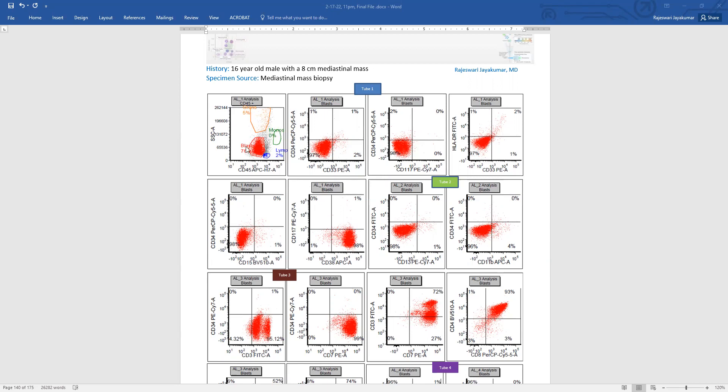So now let's follow through these cells in the blast gate and see what they express. The blasts are negative for CD34, they're negative for CD33, they're negative for CD117, negative for HLA-DR, CD15.